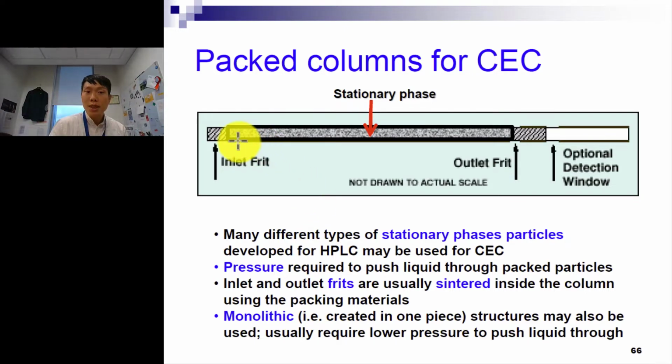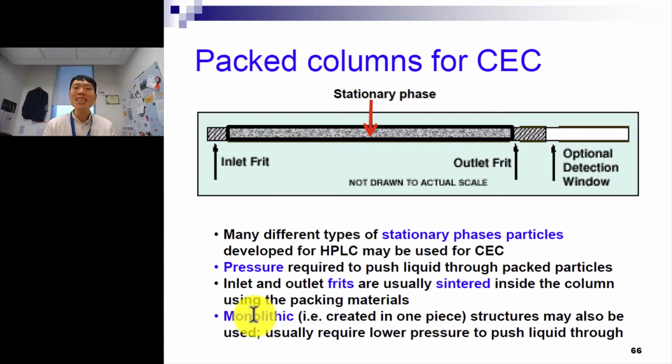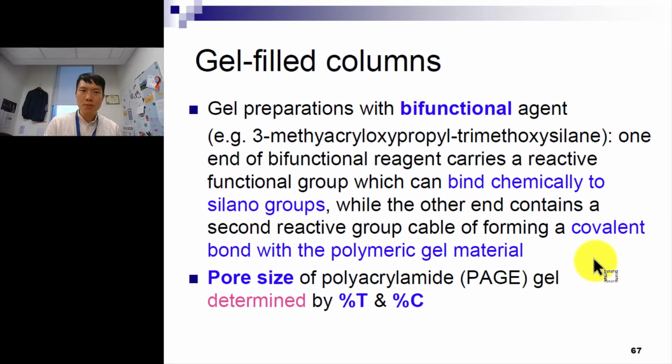So we can also use that if you can grow some kind of a monolithic silicon oxide, then we require lower pressure to push the liquid through. And the reason is that monolithic is a bit more like a crystal structure. So when you talk about crystal growing, there's a kind of systematic bond formation, right? So it's not random, like during combustion when you burn it, then you can have random formation of these holes and cavity. But when you grow a crystal, there's a crystal structure that's very uniform, and that's why we call it monolithic. And therefore, if we have a monolithic structure, it requires lower pressure to push it through.